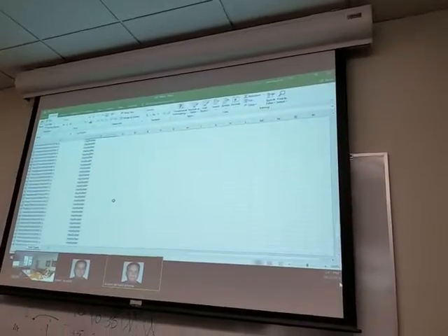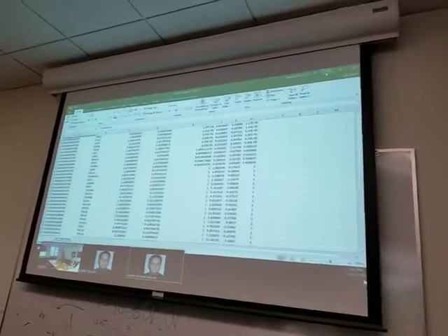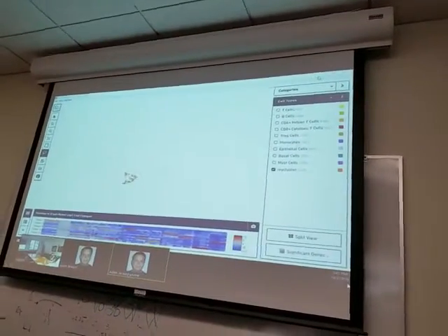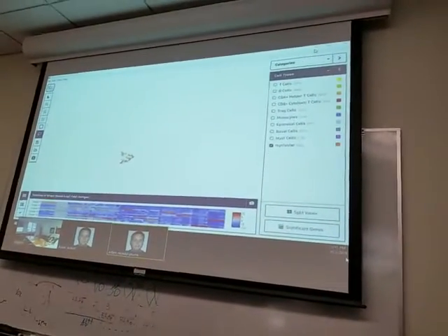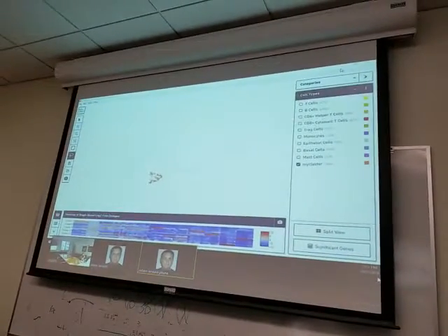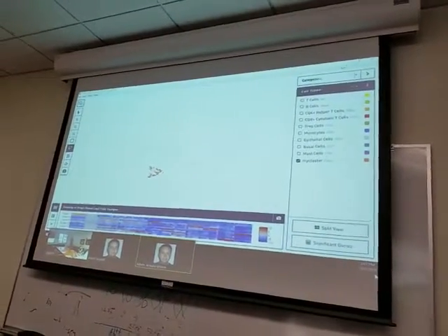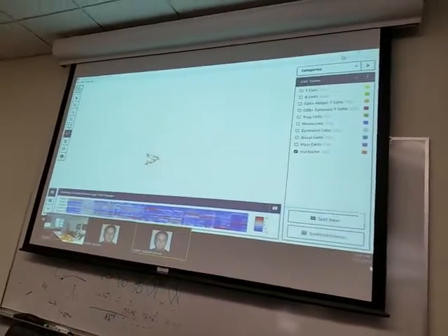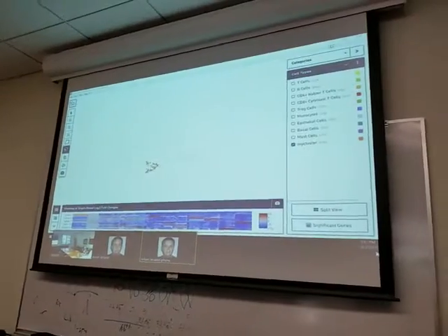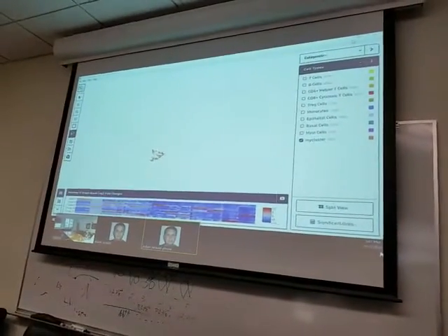One thing, this is something that we have trouble with. If you wanted to, this is like bioinformatics. We got the barcodes, we got the whole file of everybody's barcode. If you wanted to sort or match barcodes, I guess it's concatenate, but put those with other information, because there's a file that has all the gene expression for those barcodes.